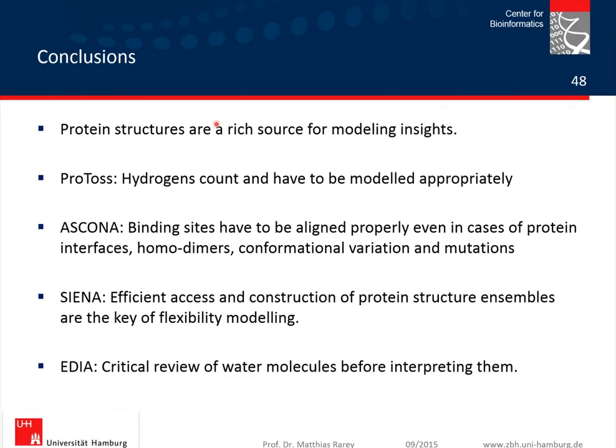And I come to my conclusions. I hope you all agree that protein structures are a rich source for modeling, and that we should use them as much as we can. Crystallography is a great tool which allows us to do all these things, but there's a certain gap between what comes out of a crystallographic experiment typically and what we need for all this detailed atomistic modeling we are doing. And so it's important to close this gap and to do this very precisely.